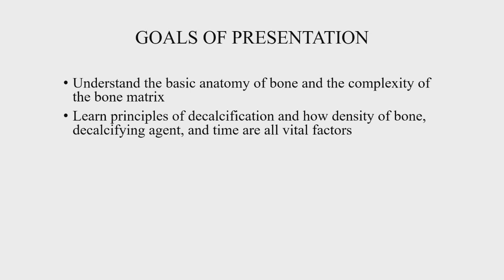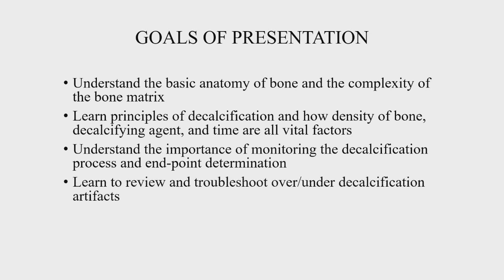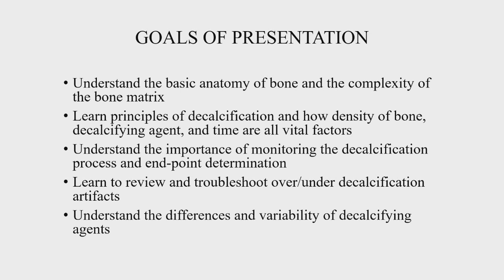So we need to really learn those principles of how to decalcify. And that further goes into understanding the anatomy first, so you can understand the density of the bone that you're decalcifying. The next goal is to understand the importance of monitoring the decalcification process and the end point determination. I don't want to go into a lot of detail on that because we're going to discuss that later in the presentation. Learn to review and troubleshoot over- and under-decalcification artifacts, and then understand the differences and variability of decalcifying agents. Many of you are using these in your laboratory.